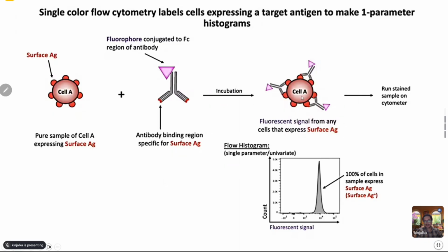There's an antigen-antibody reaction, which means you need to give it time. You have to incubate the sample with the antibodies, sometimes overnight. And then after that, you take the reading. When you take the reading, there's a specific fluorescent signal, and based on that you identify the type of cell and maybe the quantity or number of cells that are there.